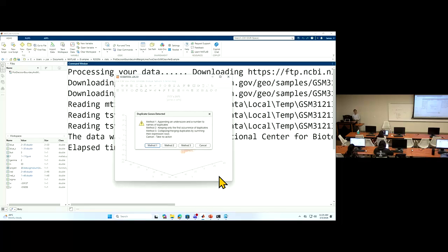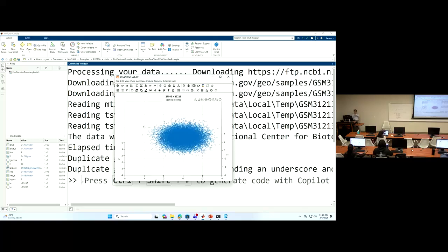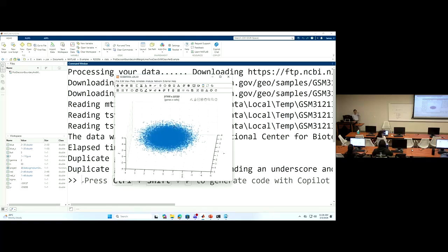I just want to use my own knowledge to annotate these cells. I know they're fibroblasts. I know they're keratinocytes. I know they're some immune cells. So we can put those names and their marker genes. So you can build your own customized annotation tool.